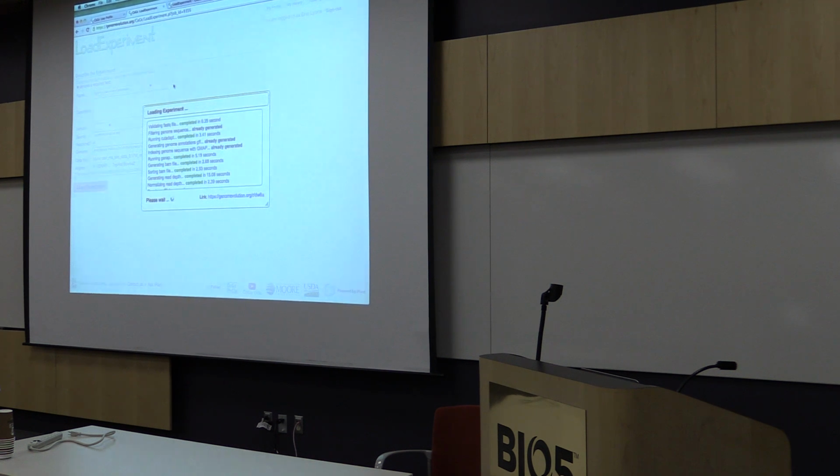Can I try yours? The version is just put in one. It doesn't matter. When we're using this for ourselves, what will that do? Well, if this is your own genome, my assumption would be that you would have a version of that genome that would be internal to your own process. Did you just select a valid data source? It tells you what to put as the version.